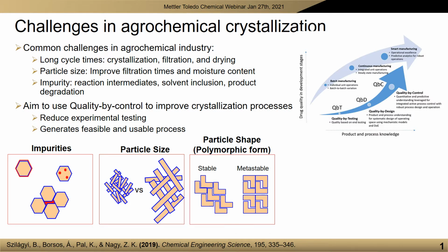Traditional methodology to address these issues involves the quality by design methodology. While it works, QbD requires extensive design space testing, which requires a large amount of material and time. With the help of process analytical technology tools and feedback control loops, we propose to apply quality by control methods as a faster methodology to find the optimal operating procedure.